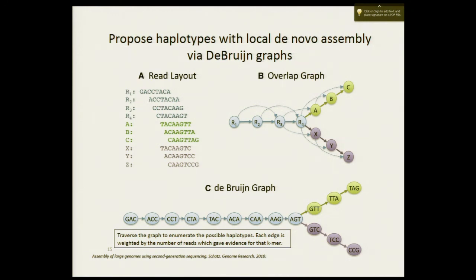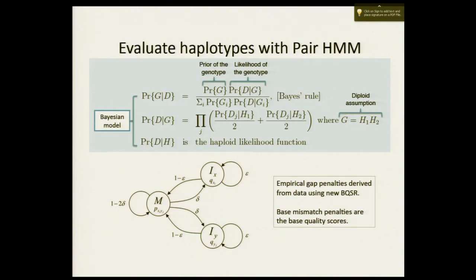The way this works is you build this assembly graph, and then you just read off these paths. In this example, it's very easy. You have 2 haplotypes: the haplotype with the TA part of the polymorphism, and the haplotype with the CC polymorphism. You run those 2 strings through the HMM, and you evaluate the probability of the data. Very simple. Like I said, you use the exact same HMM code that was used in the unified genotyper. What's beautiful here is that the transition probabilities are exactly the base insertion and base deletion quality scores we spent so much time talking about yesterday. You just plug them straight into the model. That's what makes it so beautiful.